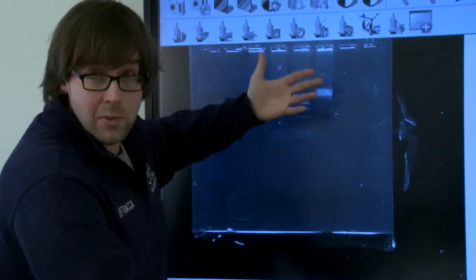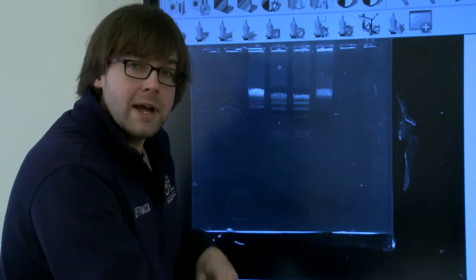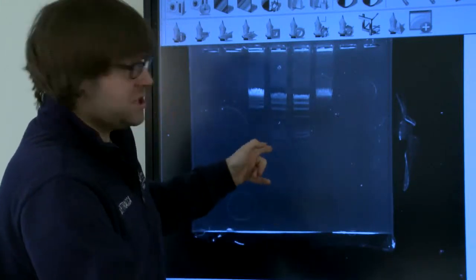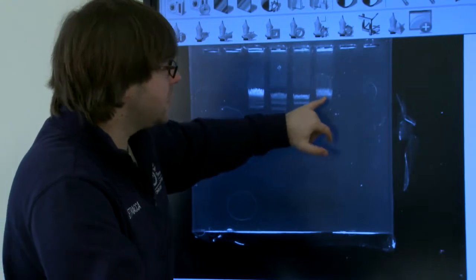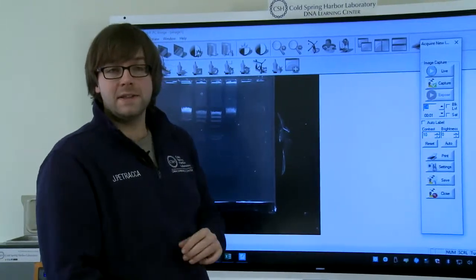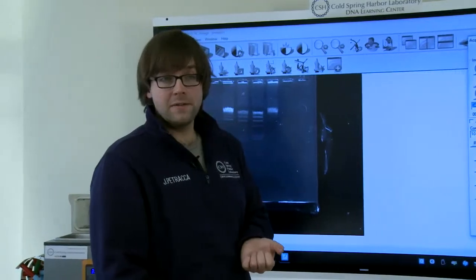Now, I sort of gave it away, but if we look at the next lane, that's our mystery. What do you think our mystery enzyme is based on the cut patterns? It matches the Hind, right? So therefore, my mystery enzyme is Hind, for sure. Okay, the control all the way over here, notice that there is no multiple different banding. It's actually just a single band, and that indicates that there was no cutting going on. That's what we should expect to see from our negative control.